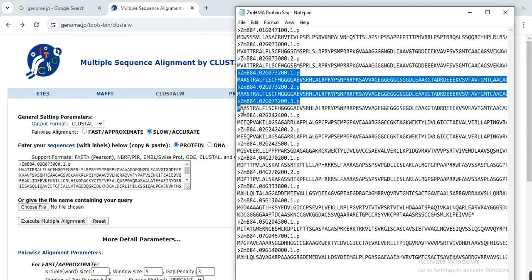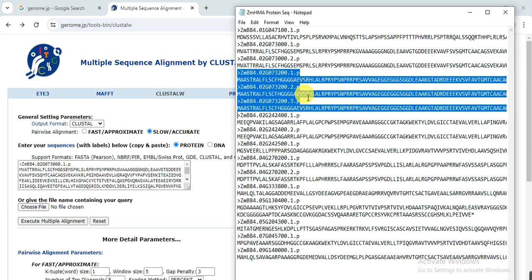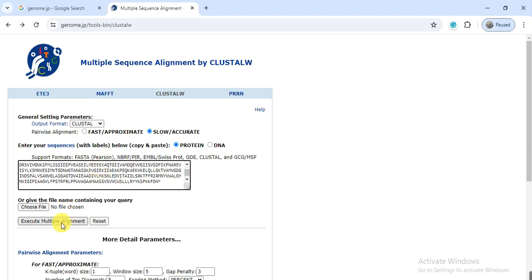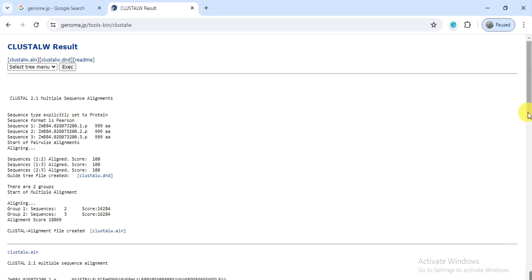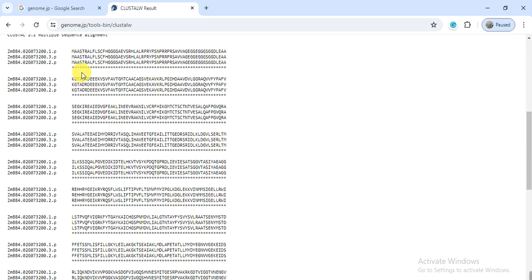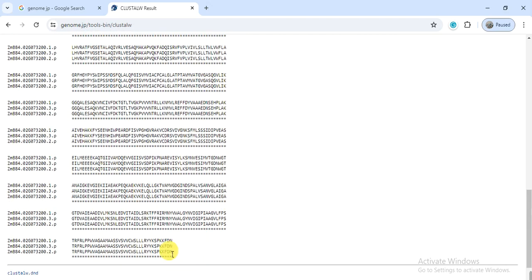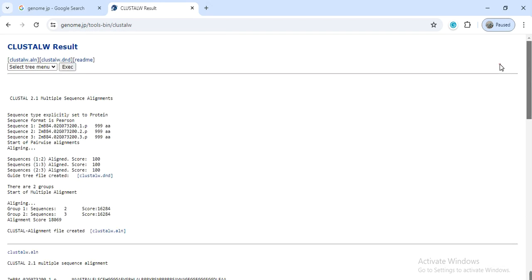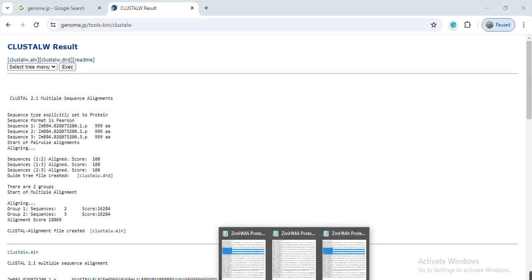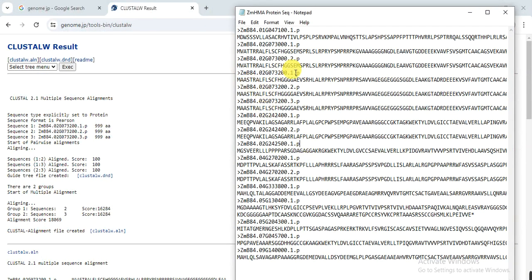Now we check another gene that has three transcripts — we copy those three and paste them for alignment. The results show there is no difference, because all amino acids show stars below the sequence. There is no difference in amino acid number or arrangement, and the alignment score is 100%, meaning these three transcripts are identical. So we will keep only transcript 1 and delete transcripts 2 and 3.